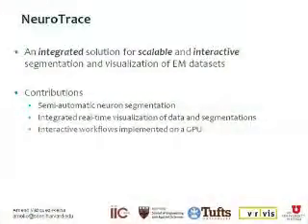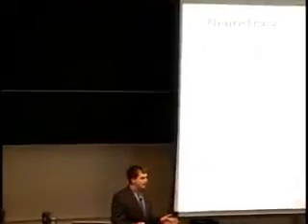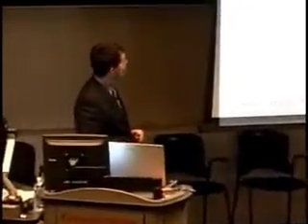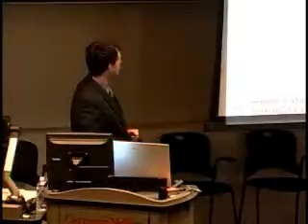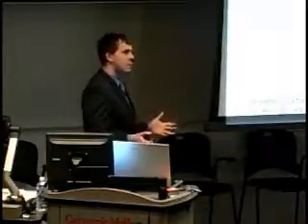So NeuroTrace is essentially an integrated solution for scalable and interactive segmentation and visualization of EM datasets. And we claim that the contributions we are making with this tool are the following. We have a tool for semi-automatic segmentation of neurons in EM datasets. It's a tool that offers integrated real-time visualization of both data and segmentations. And we are also presenting an interactive workflow for the general problem of neuron reconstruction.